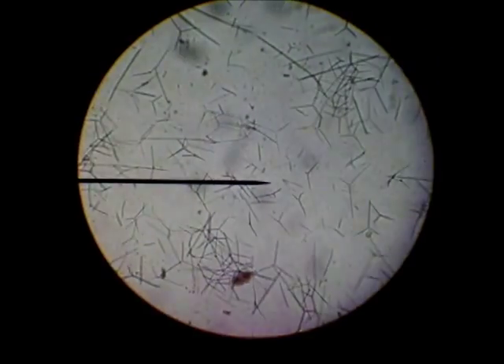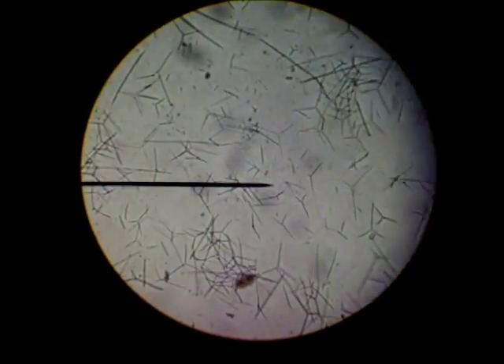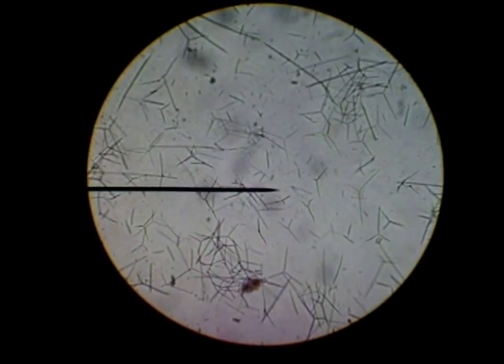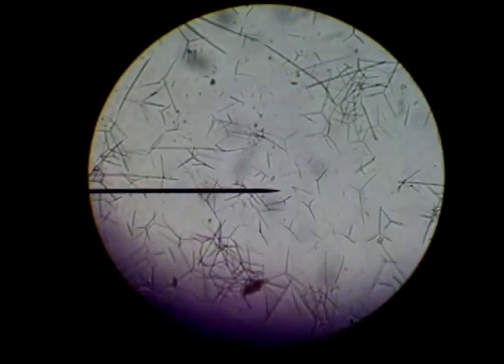These are spicules — S-P-I-C-U-L-E-S — from a sponge, which provides support and protection. It's Phylum Porifera, spelled P-O-R-I-F-E-R-A. Spicules from a sponge, Phylum Porifera.